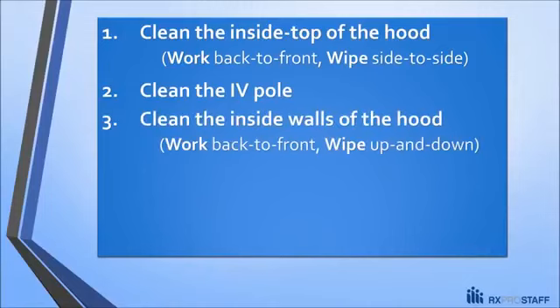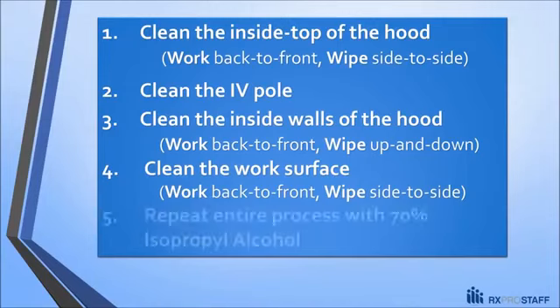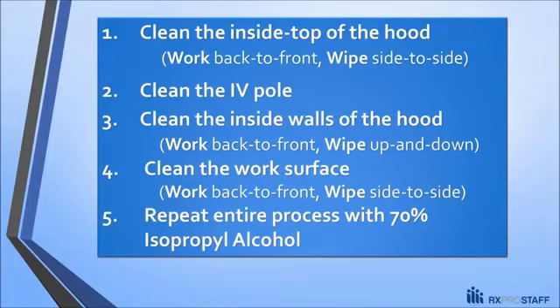Next, clean the sides, working from back to front, wiping with an up and down motion. Finally, clean the work surface, working from back to front, wiping with a side-to-side motion. Then, repeat the entire process using 70% isopropanol.